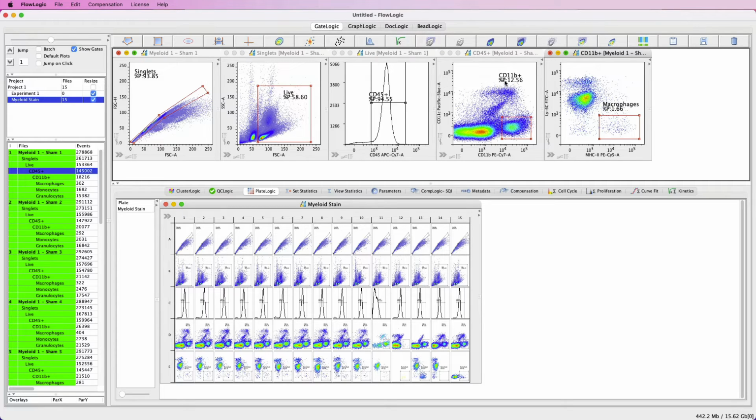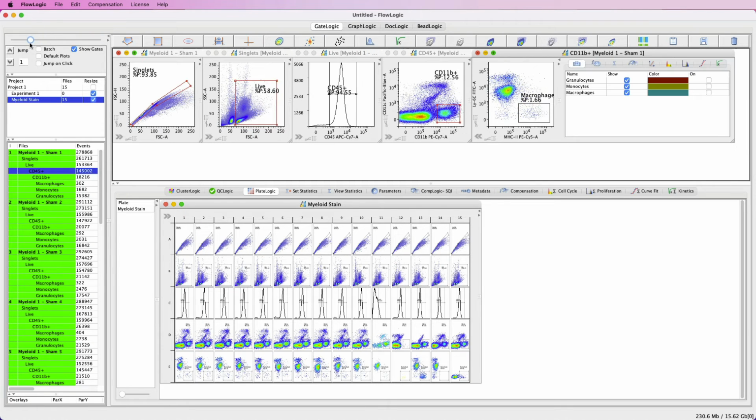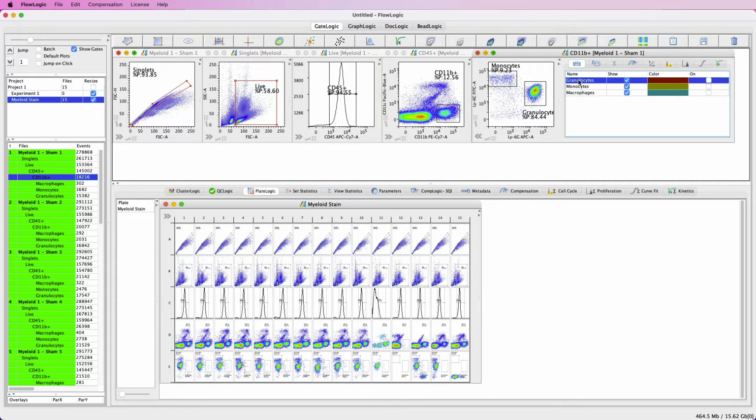We can see all of the plots from the first sample, and within FlowLogic we get an overview of all plots in the analysis. We can gain greater insight into our populations by opening the plot side drawer, and within the gate list tab, we can perform live coloured backgating. One little tip: if you wish to return to the combinations of parameters where a gate exists, simply click on the gate name and the combination of parameters will switch automatically.